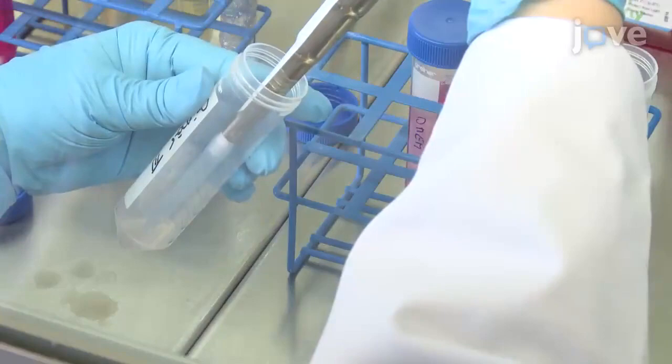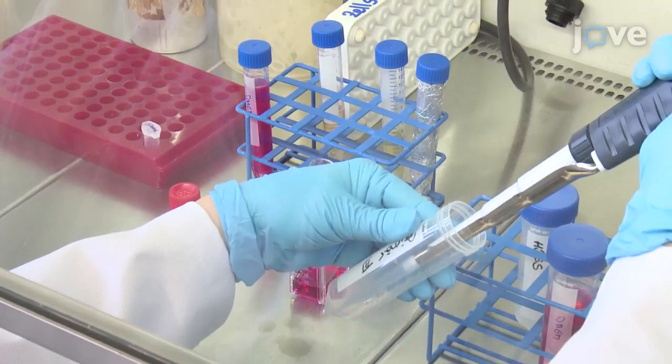Next, sieve the mixture through a 70-micrometer Falcon cell strainer and wash the suspension with HBSS.